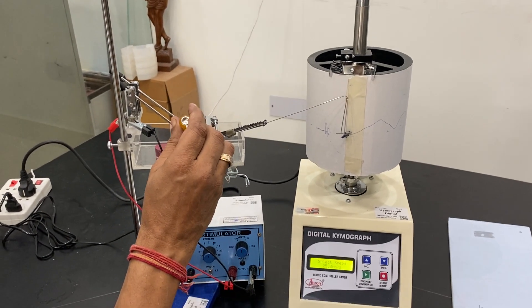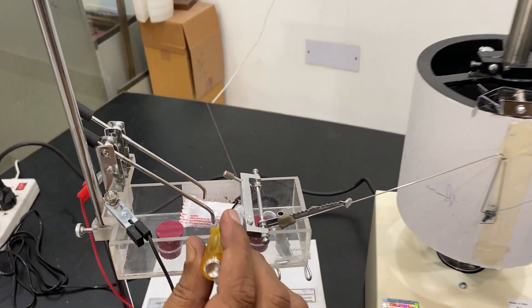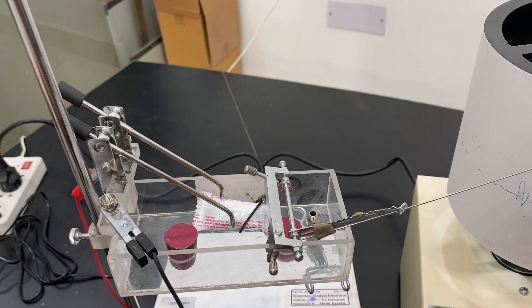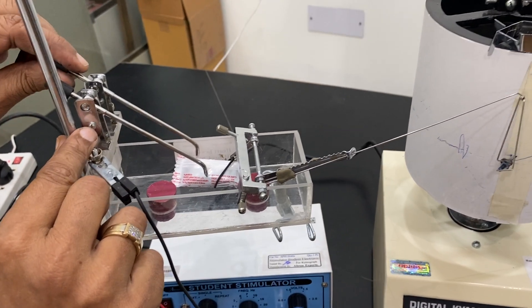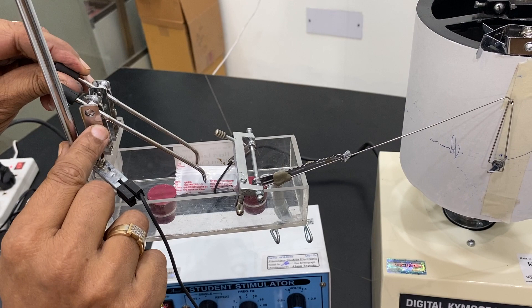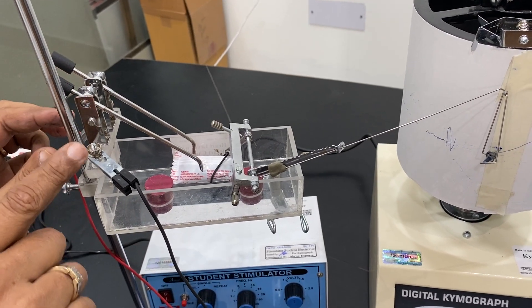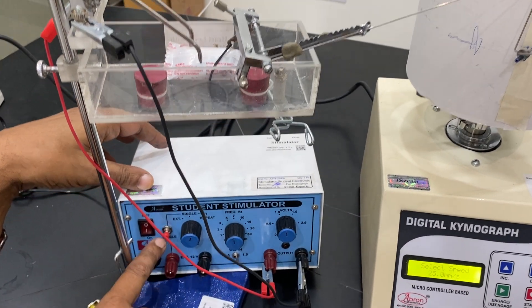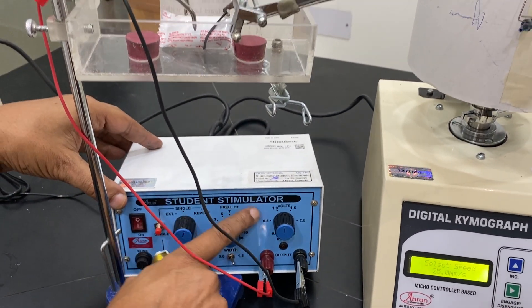I have just put a small plastic box as a heart and these are two electrodes which are adjustable. I can adjust it and put it on two sides of the heart. Anywhere as a shock I can give from the two wires I have connected to the external student stimulator.